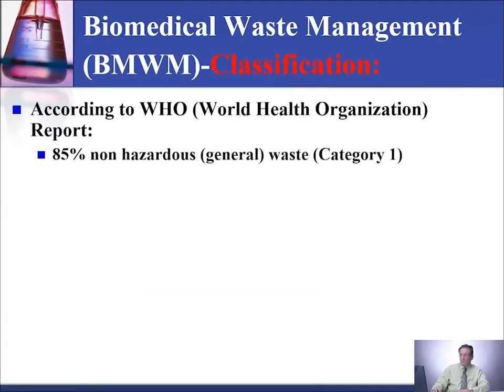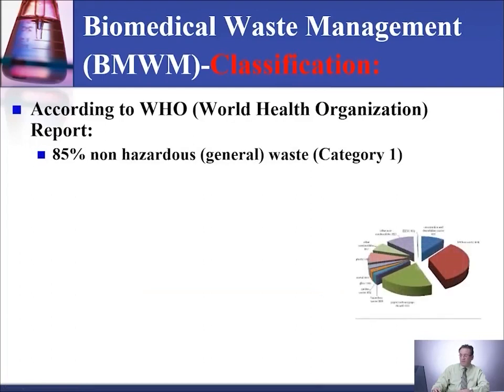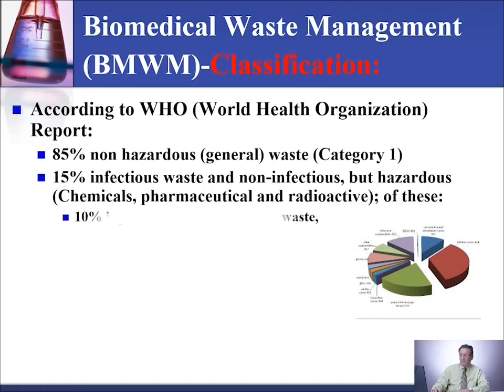Again, according to WHO, World Health Organization, 85% of the waste generated in healthcare facilities is non-hazardous general waste, category 1. Okay? And 15% of the waste generated is infectious waste and non-infectious but hazardous waste, like chemical, pharmaceutical, radioactive.